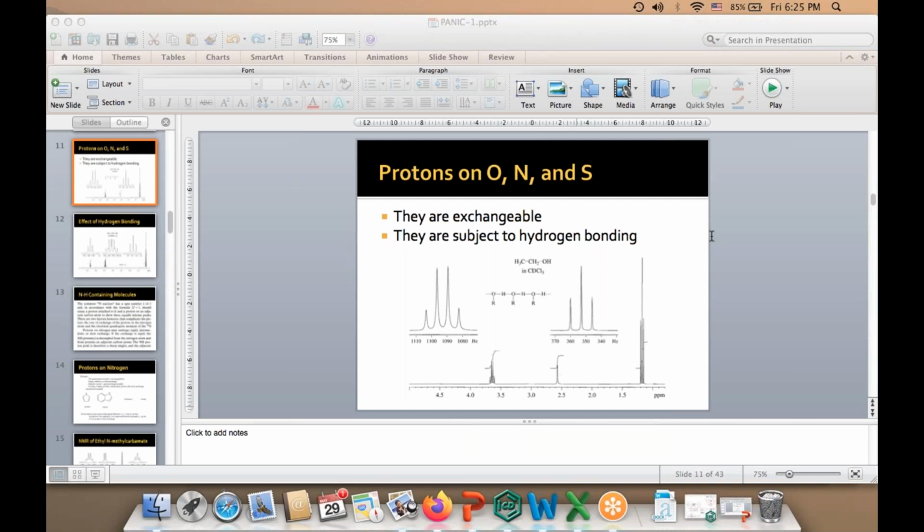But remember, you will not use a solvent containing TMS if your compound has silicon, because TMS is nothing but tetramethylsilane. So if your compound has silicon, you will not use that one. Basically, most of the time people use CHCl3, the protonated impurity.